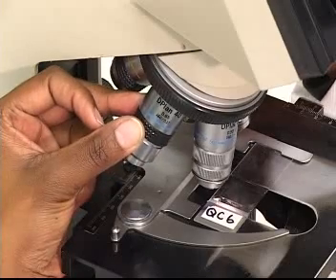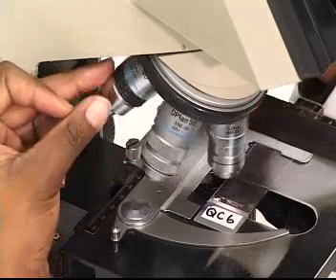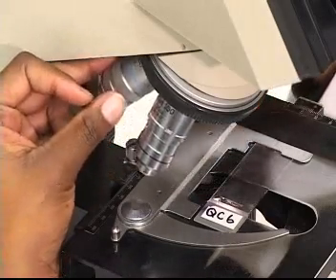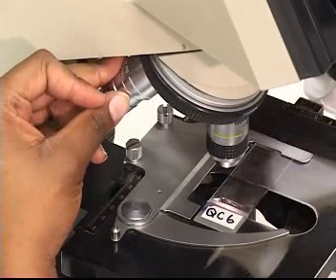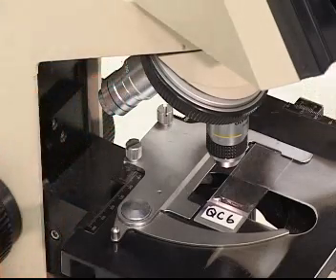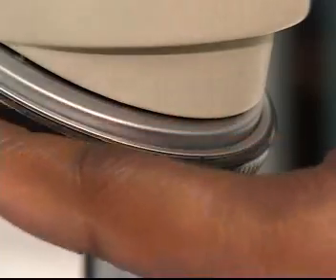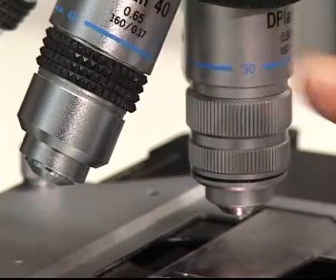If the low power objective is not in position directly above the stage opening, you need to hold any two objectives between your thumb and the forefinger and turn the revolving nosepiece until the objective clicks into position. Remember, this is the nosepiece, and these are the objectives.